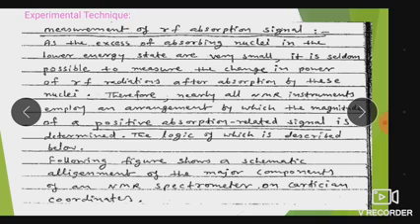What happens when a very small amount of nuclei come into resonance is measured by means of NMR.